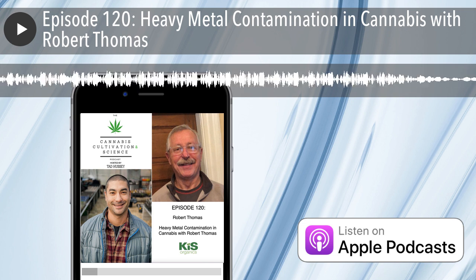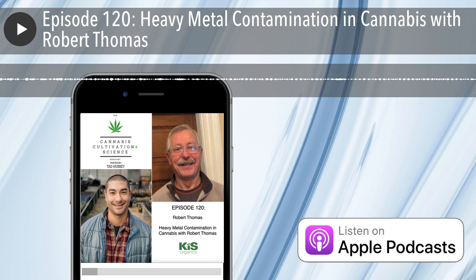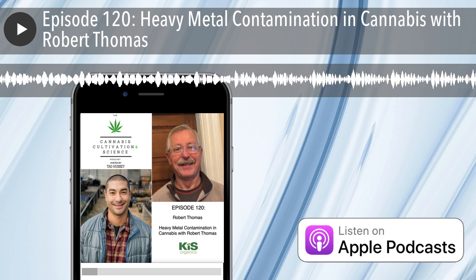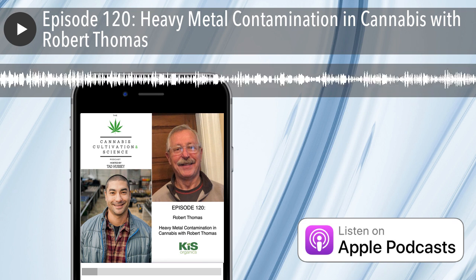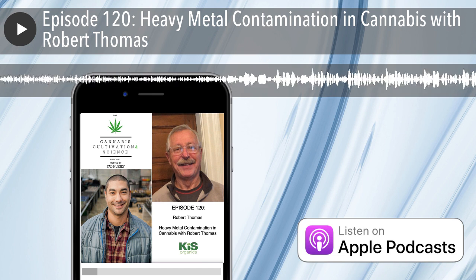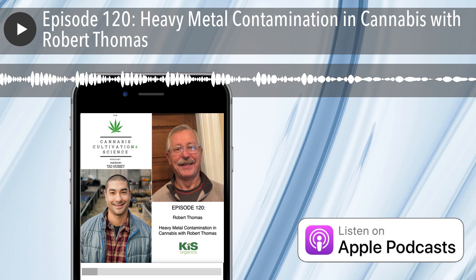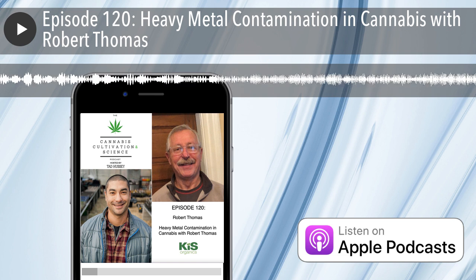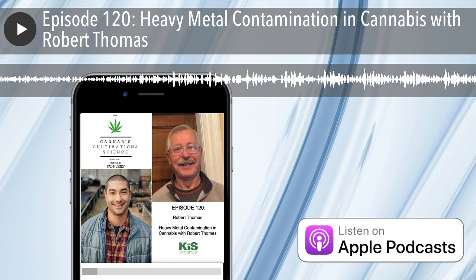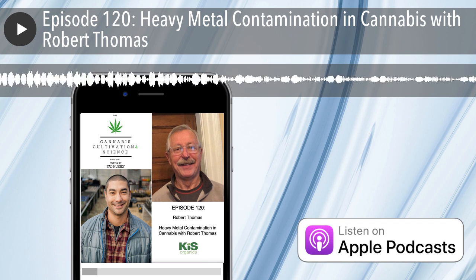It's not that the people who run them, sometimes they're inexperienced, but the fact is that ICP-MS is typically placed in a clean room, a specialized room where there can be no contamination. They have to have a positive pressure, so in other words, nothing can be blown in from outside. Normally, the sample preparation area is separate from the instrument, because you're worried about contamination when you're digesting these samples, which contain high concentrations of mineral acids. So you got to make sure that there's minimum contamination.